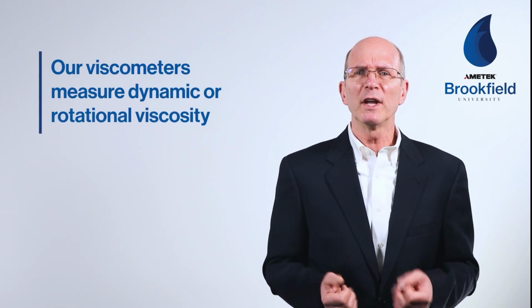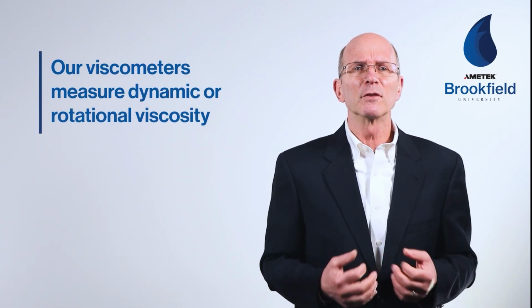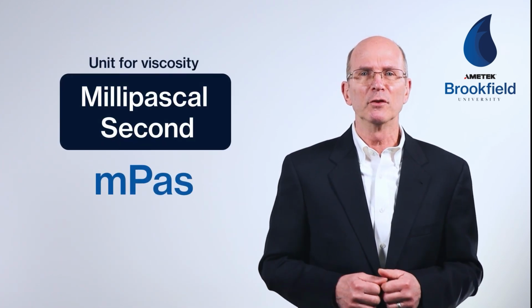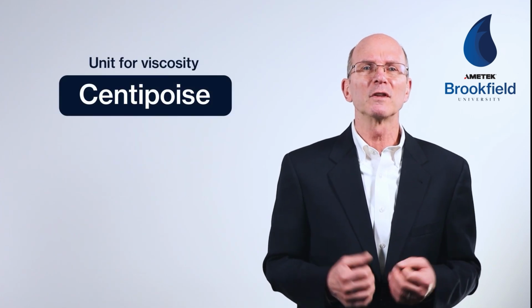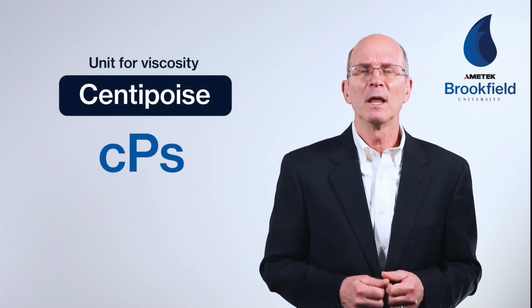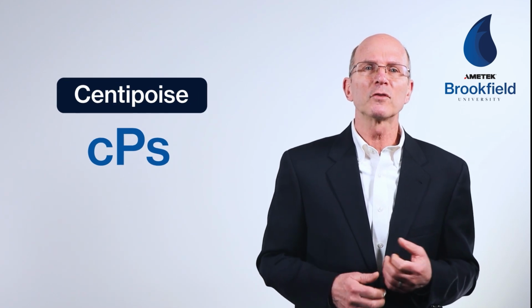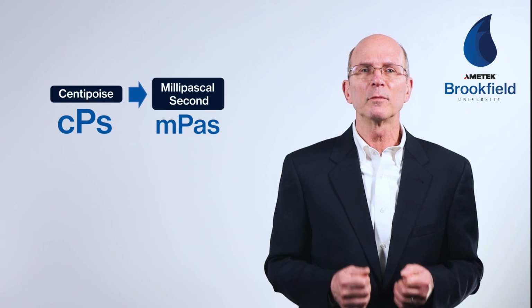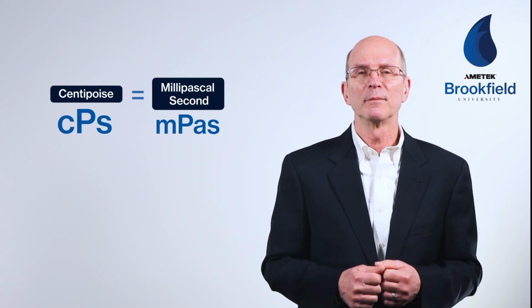When we talk about an AMETEK Brookfield viscometer, we're talking about dynamic or rotational viscosity. Viscosity units are reported in either millipascal seconds using the SI International System of Units, or in centipoise using the CGS or centimeter gram second system of units. The conversion from centipoise to millipascal second is 1:1, so both systems of units equal each other.